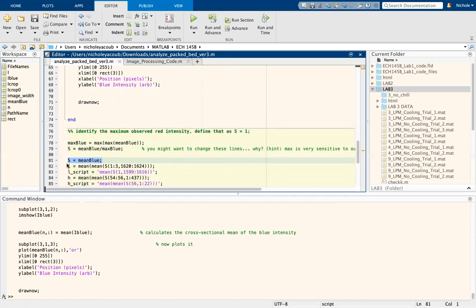and actually identify an averaged lowest intensity and an averaged highest intensity. And so when we're thinking about lowest intensity, we're thinking about things that have not saturated yet. And so it's ideal to think about the earliest time steps. So right here, I'm averaging over the first 3 times in the trial. Whereas in this, I'm talking about the highest points in the column, or the things farthest to the right in our cropped images. So I'm averaging over this range.